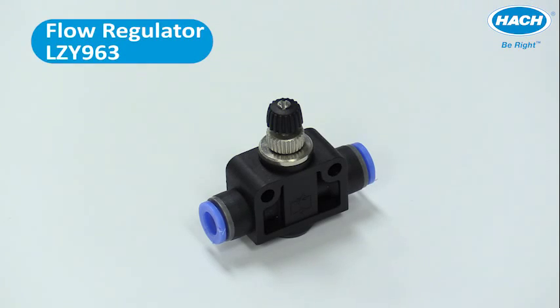Flow regulator, part number LZY963, is also included. It is used to regulate flow rate on the waistline and provides necessary back pressure to prevent air bubbles in some samples.